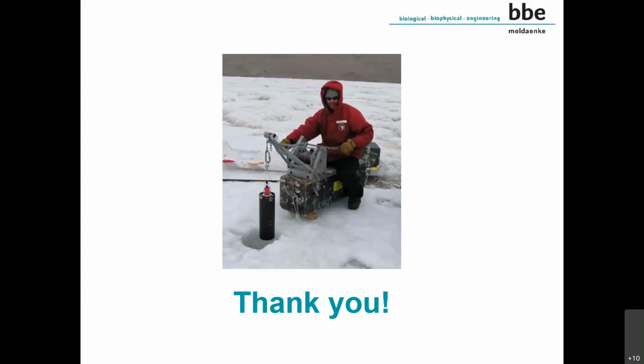Yes, I want to add a little topic that is also a benefit of the FluoroProbe, the big instrument: we really measure the yellow substances, because the yellow substances have a big overlay in the fluorescence where algae also have a fluorescence. And if you don't make this estimation of the yellow substances, you have an overestimation of algae. Just as a short feedback.